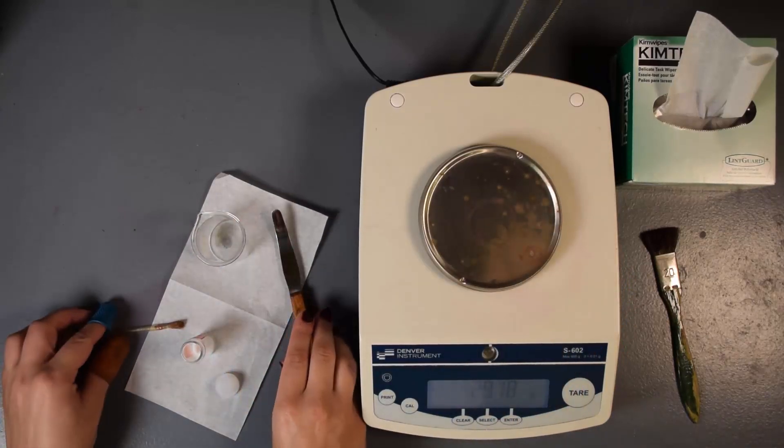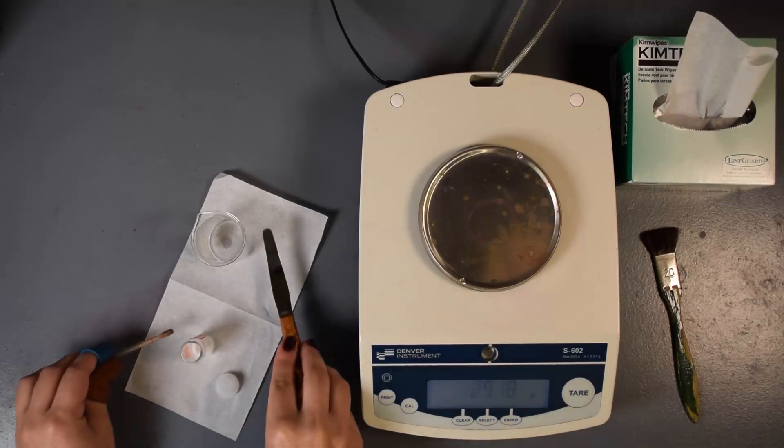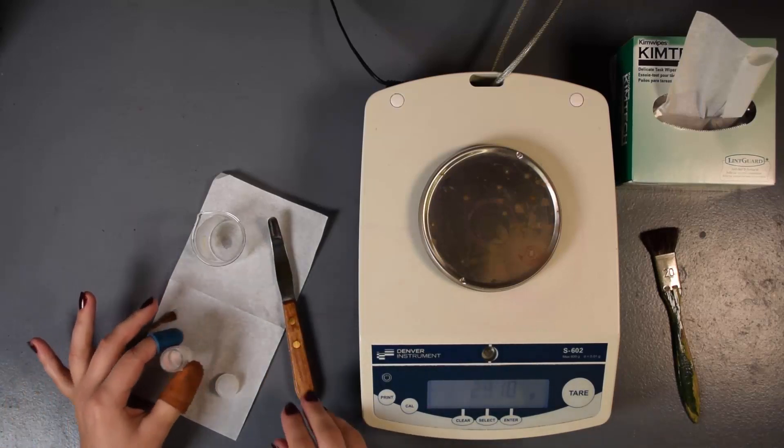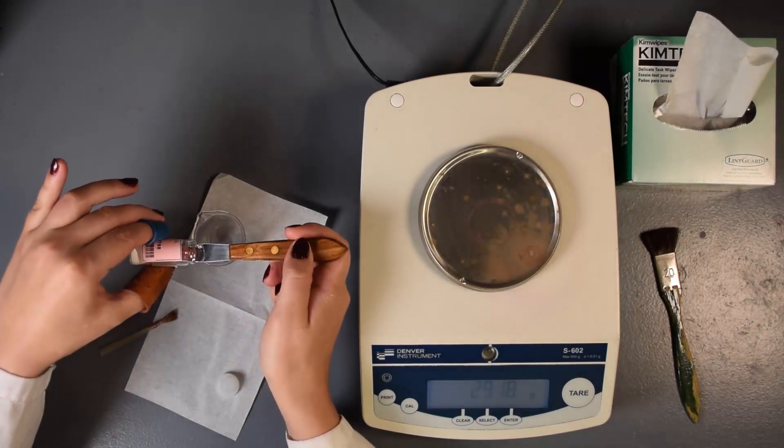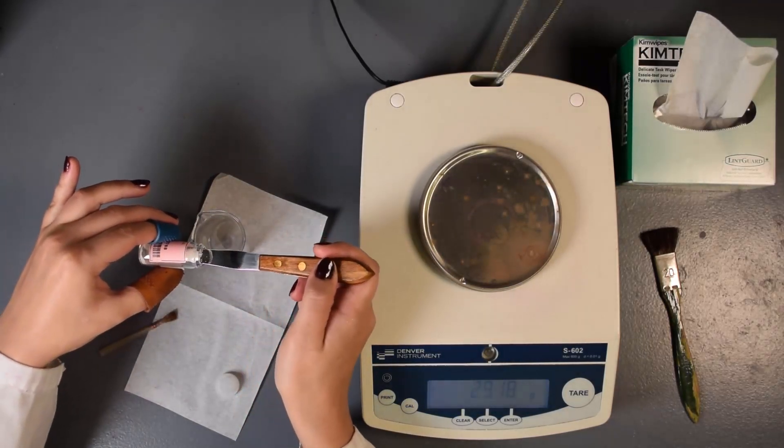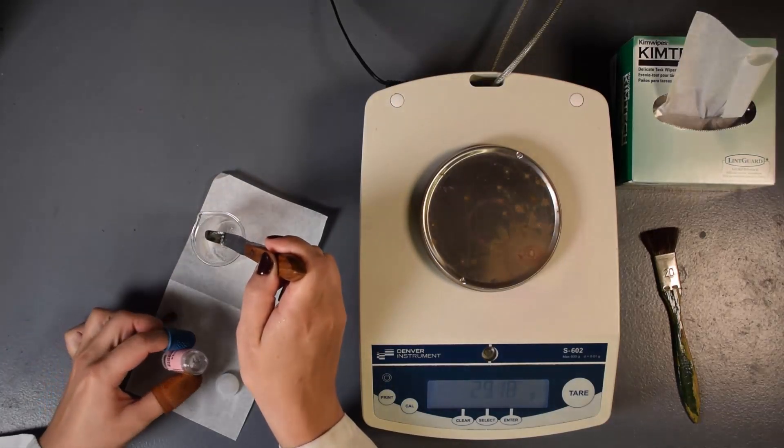Make sure your camel hair brush is clean by brushing it back and forth on your spatula. Hold the container over the beaker and carefully transfer the desired amount of compound from the container into the beaker using a spatula and camel hair brush. Remember to not touch the container with your bare fingers.